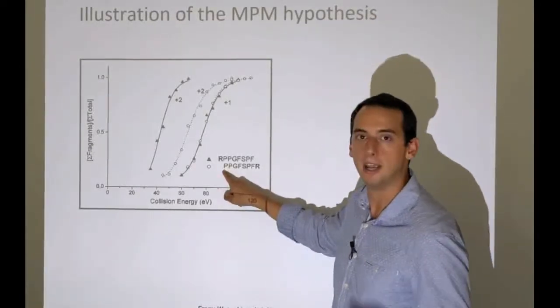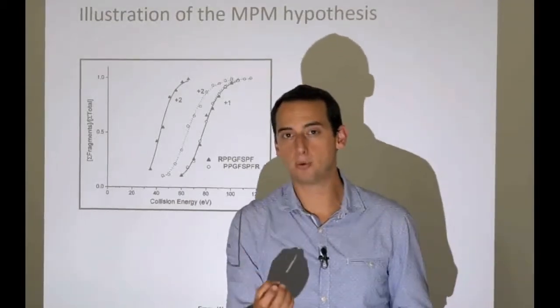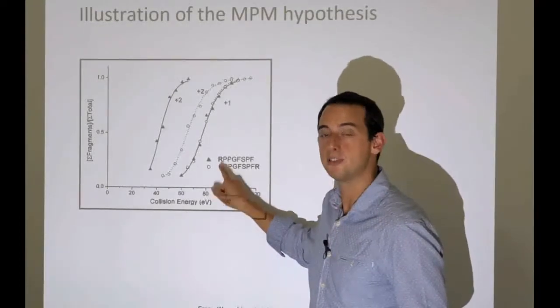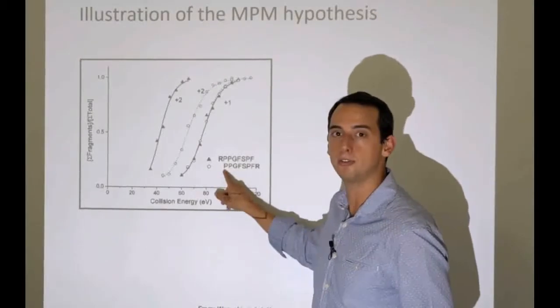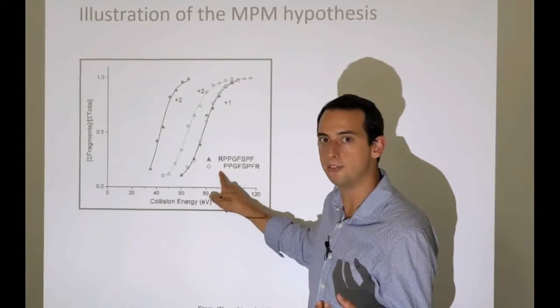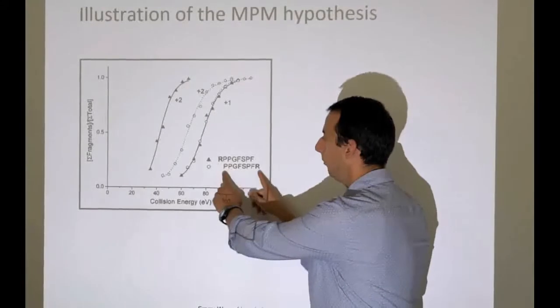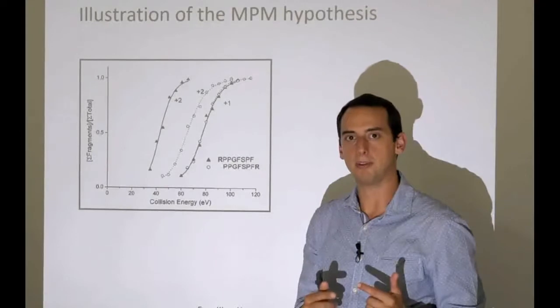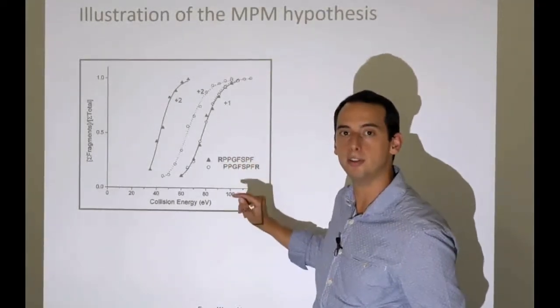But look at this. We have an N-terminal proline. And remember that the N-terminal proline, the amine group, which is cyclical there, that amine group is pretty basic. So our second proton is going to find a happy home on the N-terminus. As a result of this low energy state it can occupy here on the proline, it's not going to travel around. So we've got two locked down protons, one here and one there. And that situation leads to poorer fragmentation because we don't have a wandering proton like we had in the first case, in the triangular case.